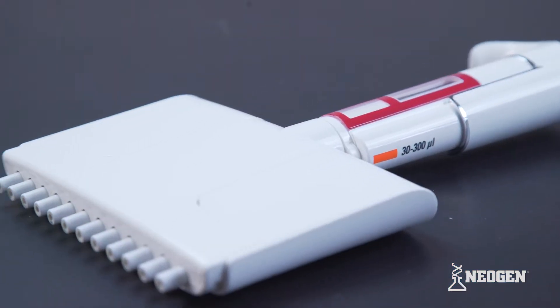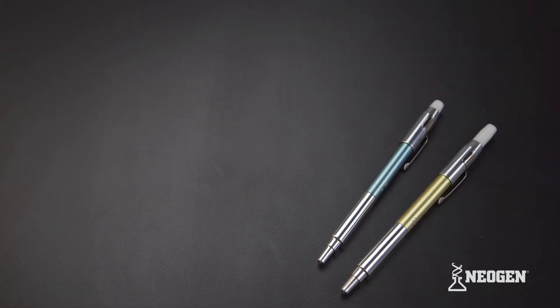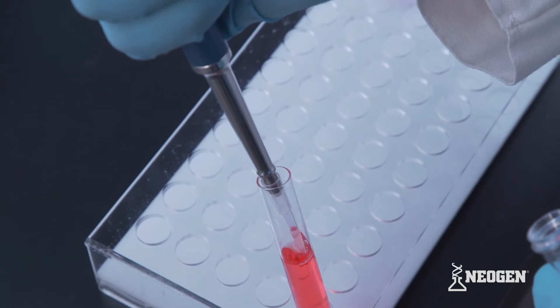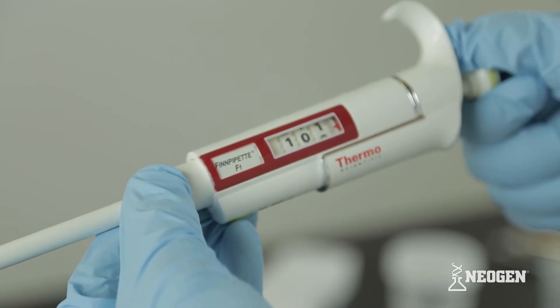The brand of pipetter in this video is the FinPipet Adjustable Multi-Channel Pipetter. Neogen also has instructional videos for pipetters that can draw up a fixed volume with no overfill level, and adjustable single channel pipetters with an overfill level.